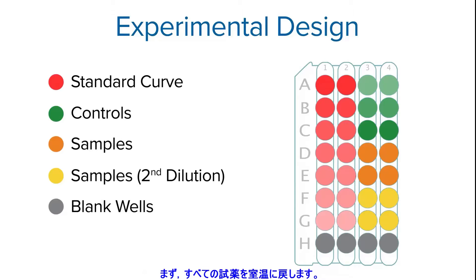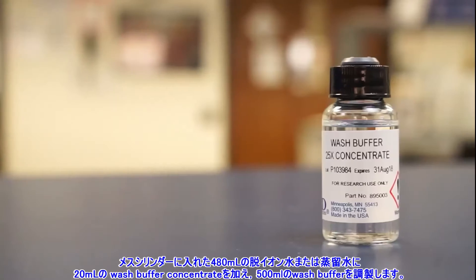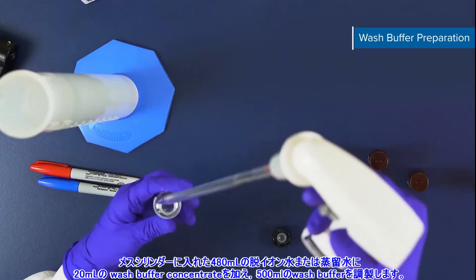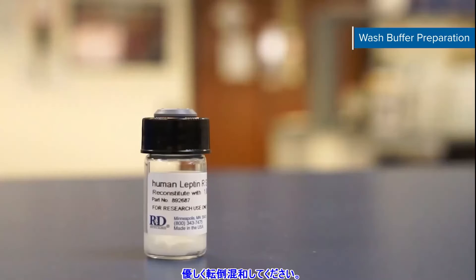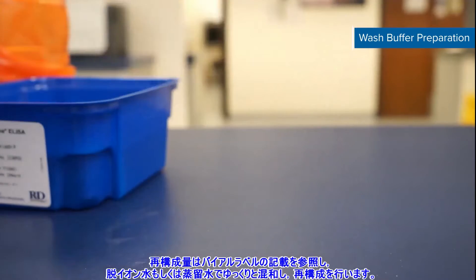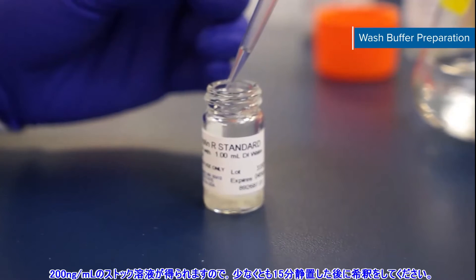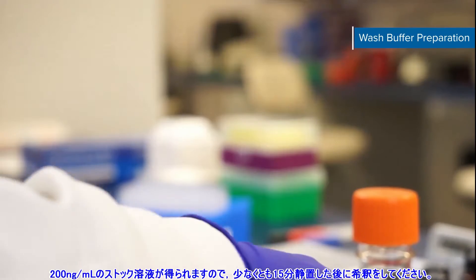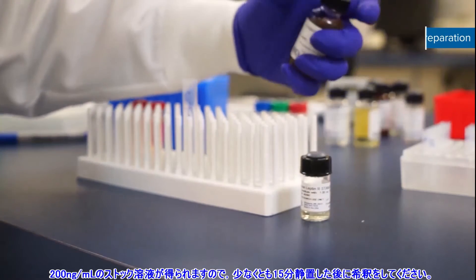To prepare reagents, first bring all kit reagents to room temperature. To prepare your wash buffer, add 20 milliliters of wash buffer concentrate to 480 milliliters of deionized or distilled water in a graduated cylinder to yield 500 milliliters of wash buffer. Mix gently. Next, prepare your human leptin receptor standard. Refer to the label on your vial for specific reconstitution volume. Reconstitute with deionized or distilled water. The reconstitution produces a stock solution of 200 nanograms per milliliter. Gently mix the standard to ensure complete reconstitution and let it sit for a minimum of 15 minutes prior to making dilutions.